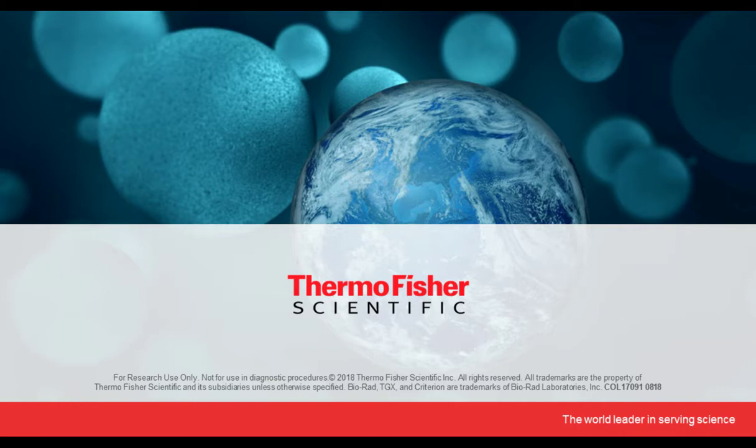DNA is known to cause bands to be in a V shape, or salt concentration would cause a band to appear a little bit squiggly. Like we discussed today, it is important to make sure that such contaminants are either removed or kept at a minimum to avoid such artifacts during gel electrophoresis.